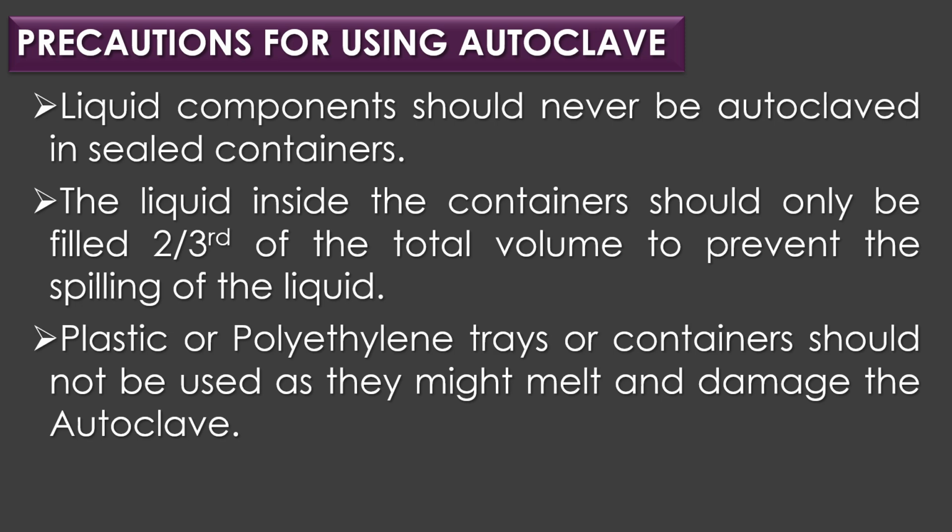Liquid components should never be autoclaved in sealed containers. The liquid inside the containers should only be filled 2/3 of the total volume to prevent the spilling of the liquid. Plastic or polyethylene trays or containers should not be used as they might melt and damage the autoclave.